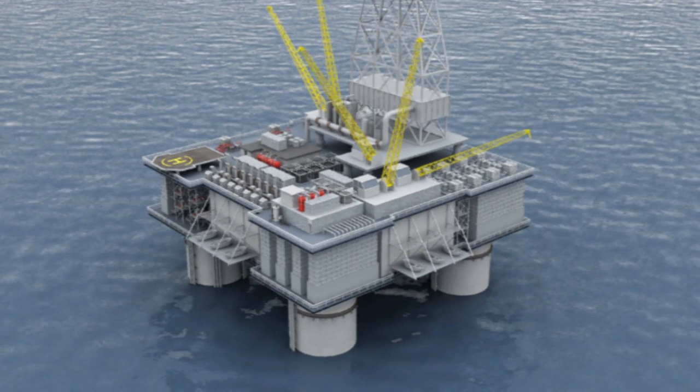Advanced sensors. The world's best oil-in-water analyzers. Believe it.